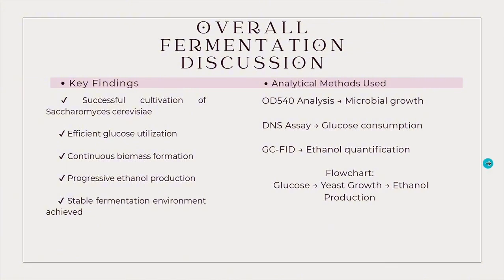Overall, the experiment also highlights the importance of maintaining stable environmental conditions such as aeration, agitation, pH, and temperature to ensure efficient microbial activity and stable fermentation performance.